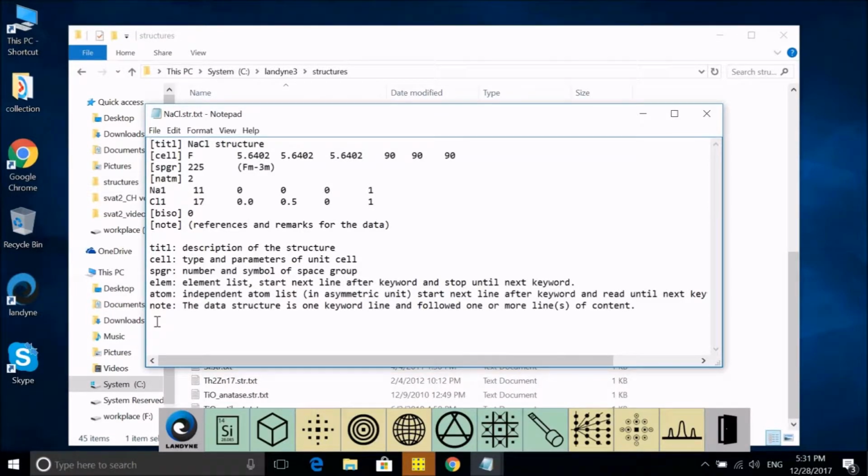However, you may have trouble if you write the format not exactly as required here. So we recommend you use the template to create the new files. We also suggest you view the structure using SAED3 after you create a new file. SAED3 is this software, the cubic one.